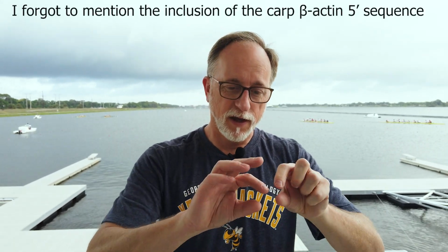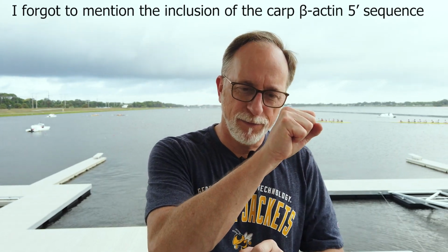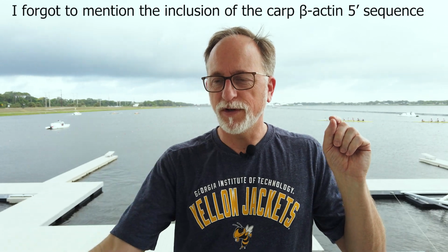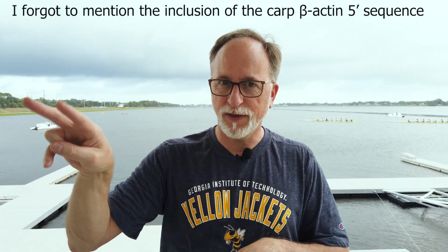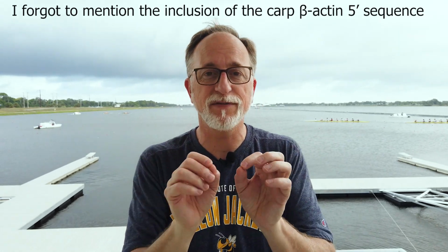A fish will not be frozen. Amazing. Well, we reasoned that if that fish produces a lot of that protein, the promoter that turns the protein on must be very strong. So we had this piece of DNA with a promoter for that gene in it, and we treated it with enzymes. We took the DNA out of the bacteria, treated it with new restriction enzymes, and ligated it into a circular, sometimes a linear, piece of DNA that we then put into fish.